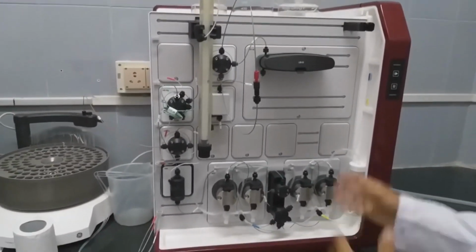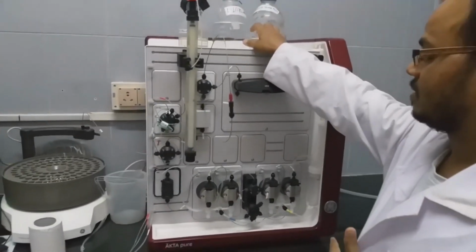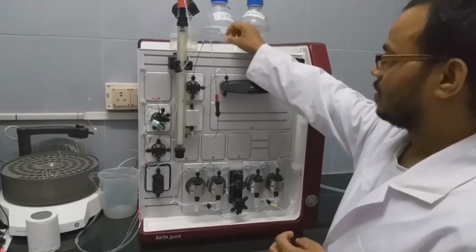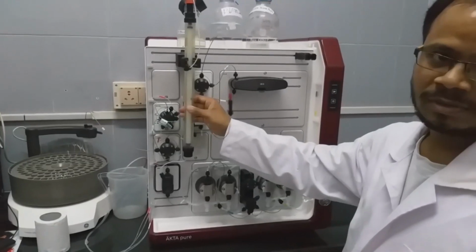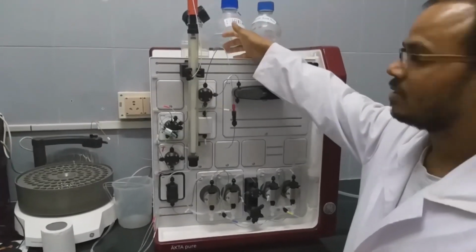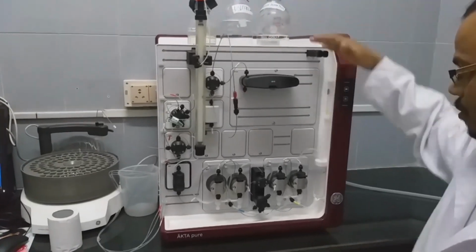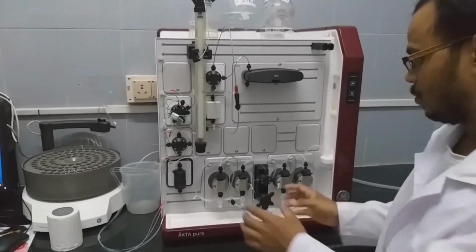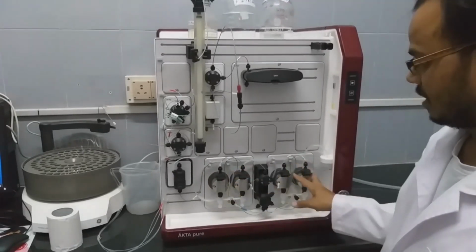So this system contains this stationary phase. This is the column. This is the mobile phase, that means buffers. This is the area where we will keep all the buffers. So it starts with the pumps actually. These two are pumps, pump one and pump two, these two sets.